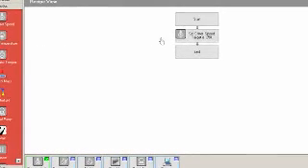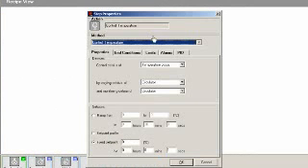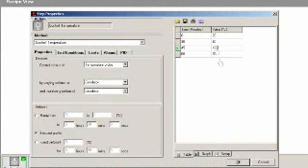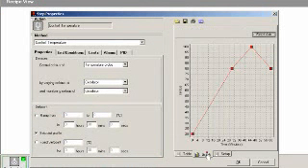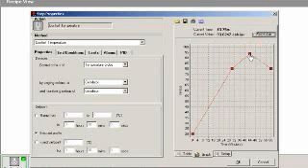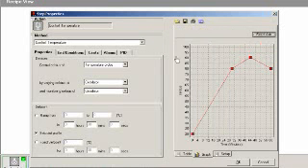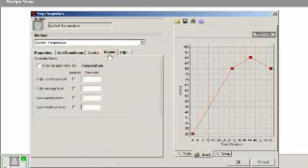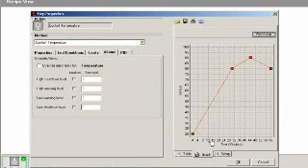In the recipe view, steps can be created in series or parallel by dragging on action icons. Set points, ramps, or sophisticated profiles of control parameters can be set using tables or graphs. It's also easy to define end conditions, shutdown limits, and alarms.